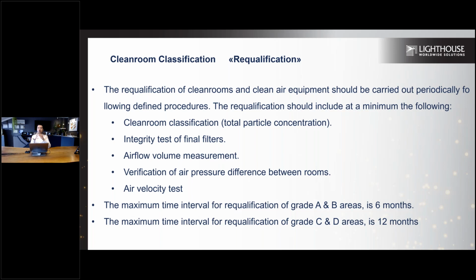All of these tests are defined in ISO 14644-3 cleanroom test methods, and it describes how you will achieve these tests and how you will implement them.